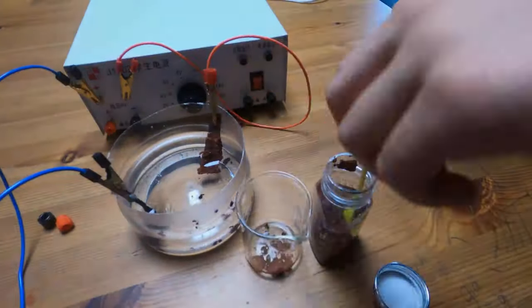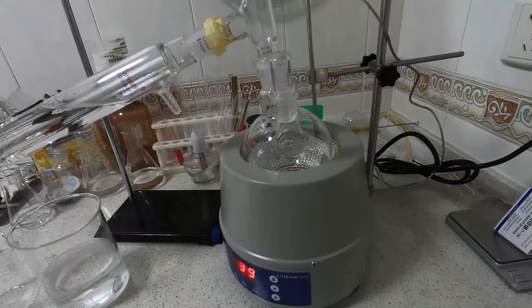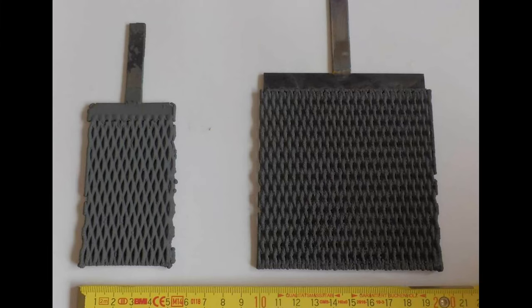Hey guys, this is Neutron Star. Welcome to my bathroom lab. In the first video, I made some dilute sulfuric acid. In today's video, I'm going to tell you how to make a lead dioxide anode.